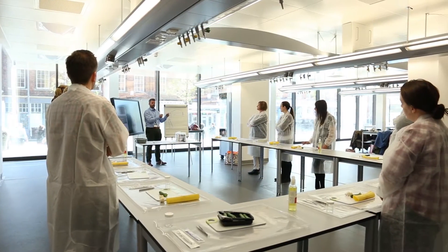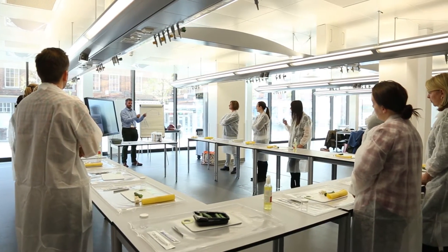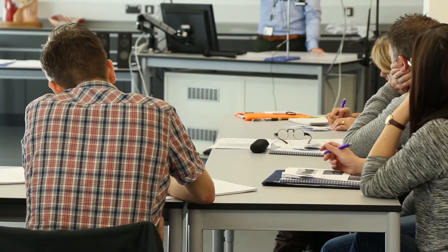The specimen dissection course is a joint venture between ourselves at the University of Wolverhampton, the Biomedical Science and Physiology department, and the Royal Wolverhampton NHS Trust. The University works quite closely with Wolverhampton NHS Trust. The course is designed for biomedical scientists who are already working within histology, and it's a continuing professional development course to support their development within histological dissection.